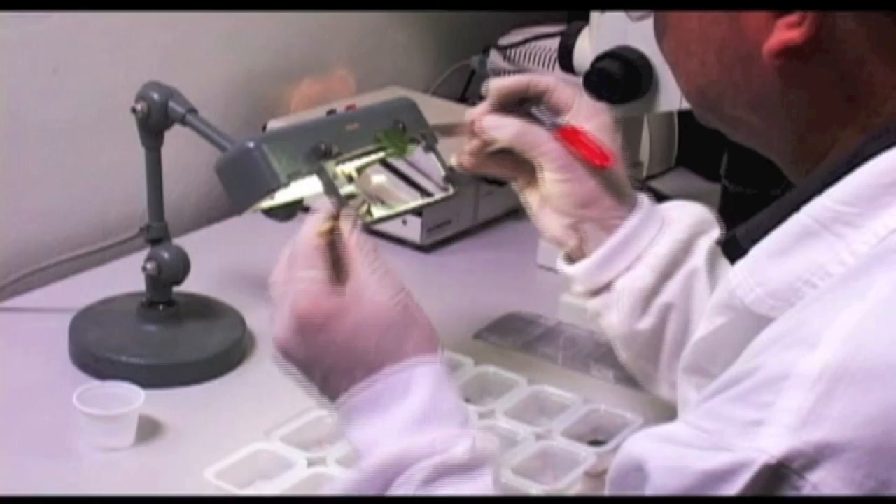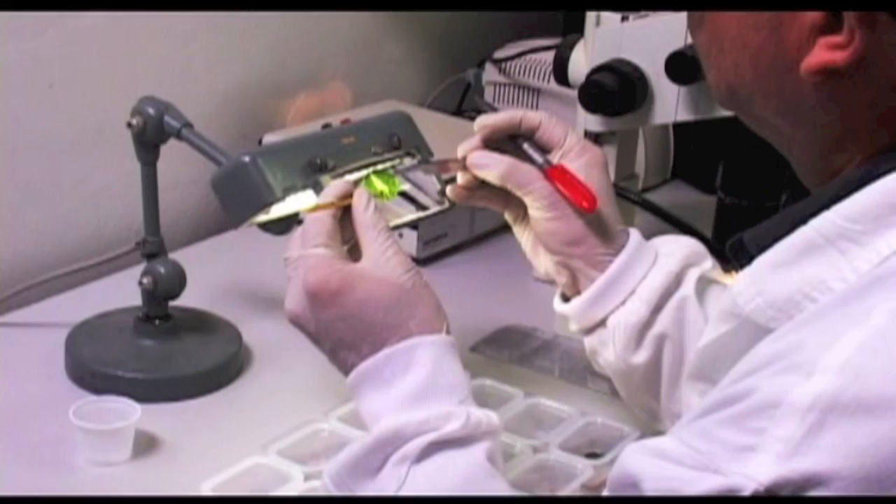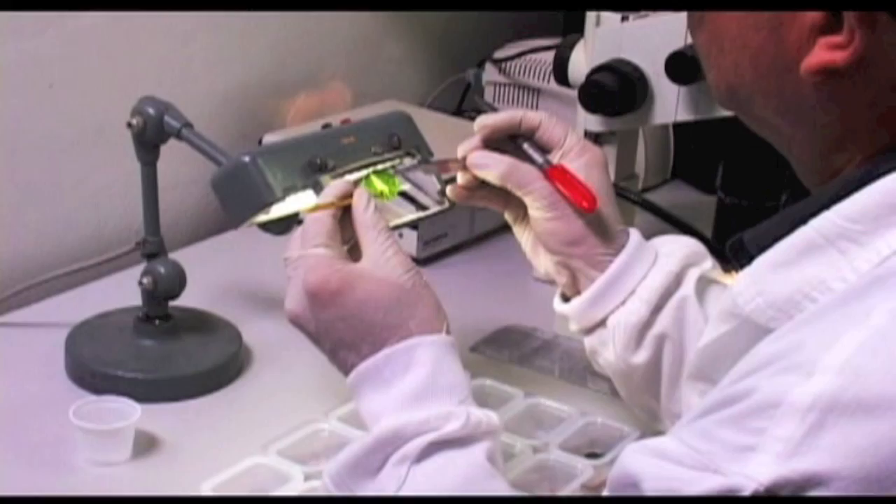After 72 hours, trays are taken from the incubator. Cells are opened, the leaf disc is removed with forceps, and both the leaf disc and the cell are carefully inspected to find the larvae.